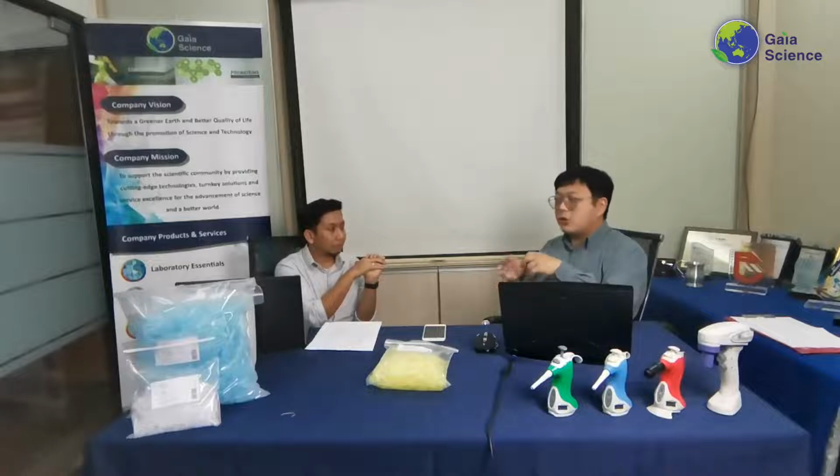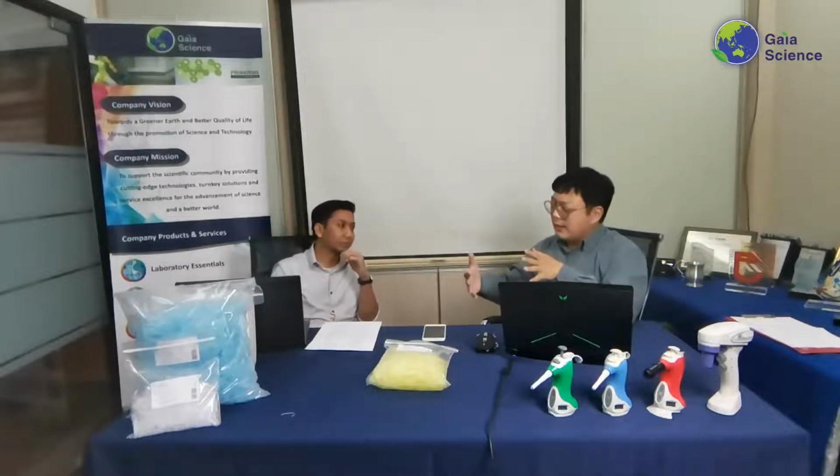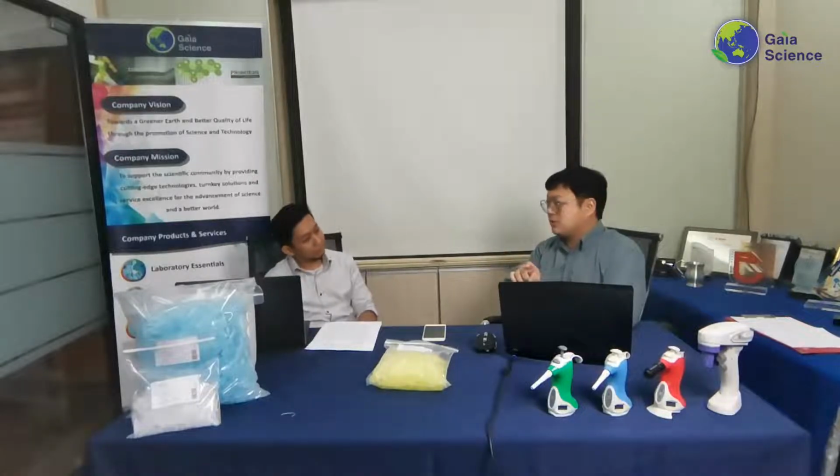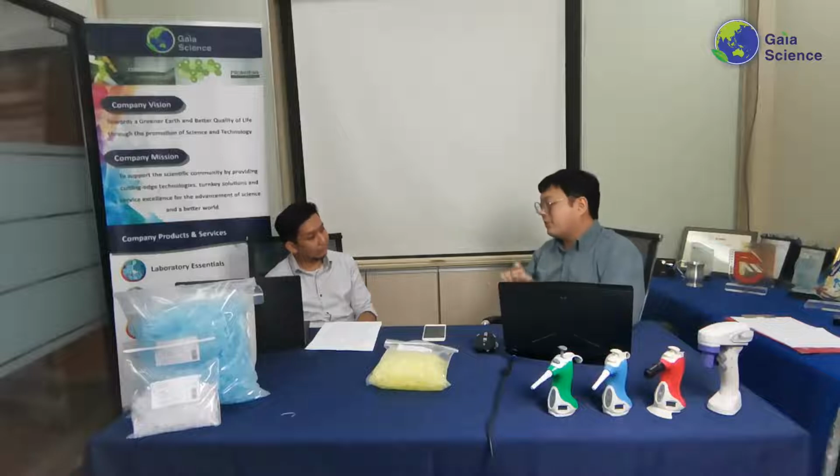If your technique is always autoclaving the bulk tips, then you definitely can, and if all the experiments came from autoclaving the bulk tips, that's fine. Just that you can't autoclave the filtered tips. I do know that they sell bulk filtered tips as well, but those bulk filtered ones cannot be autoclaved either.